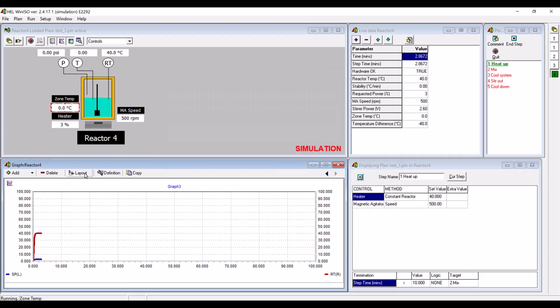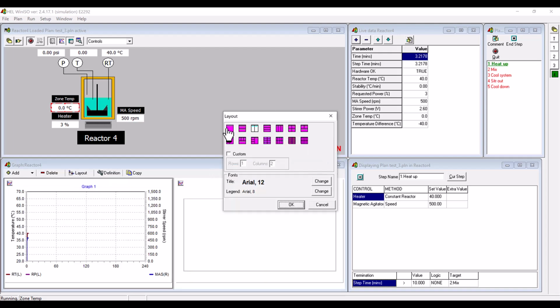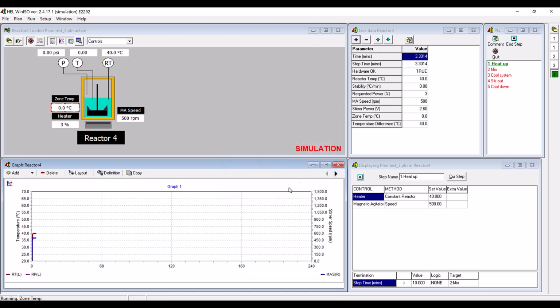And then we can decide how we want to plot them. So we want, for example, two of them side by side, have one here again, so we can just come here, boom. We can have just one here like we see here.